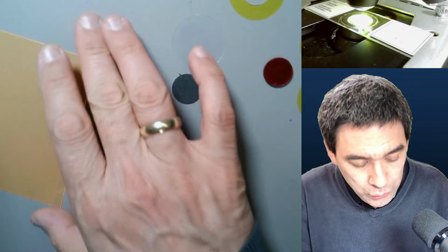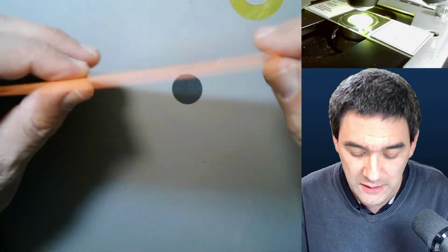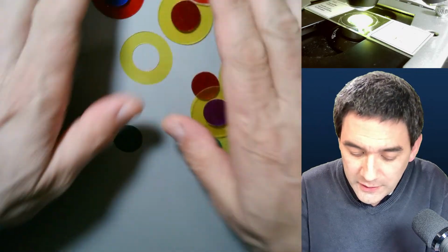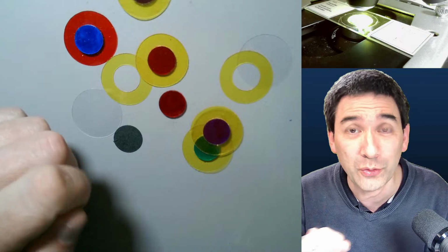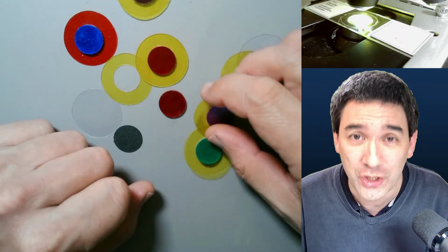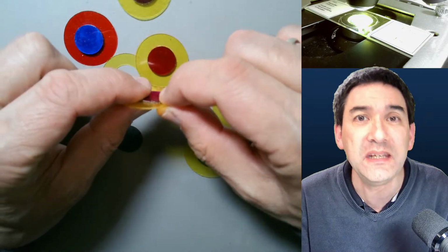However, as a general rule of thumb, yeah, and that's basically one of those foils that's used. Apparently, they are used if you want to change the color of lights, of lamps, right? Then you can actually use those. So what I've done, however, in the past, several years ago, when I also tried this, I tried to print them using color laser or inkjet on overhead foil. This also kind of works, but has the disadvantage that the intensity is not quite as high. And so sometimes you have to print it over several times. So I think that this is quite an easier way.